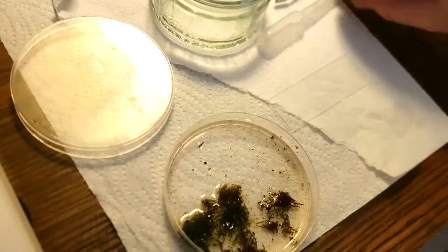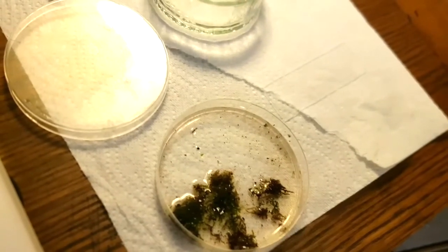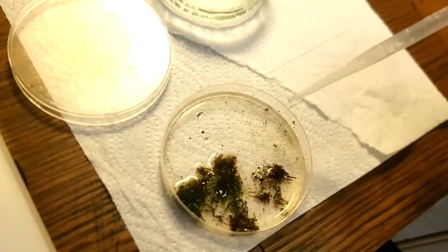Okay, so it's now the second day of tardigrade hunting. This is actually a couple of days since I was last filming. So I'm just going to try sucking some bits of this sample up with a pipette and see if there's anything interesting in there.